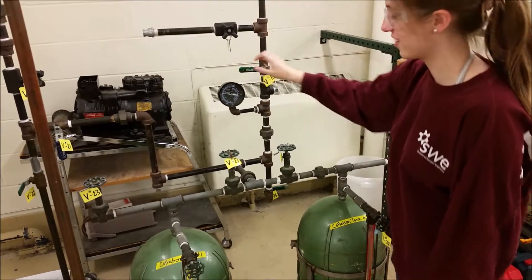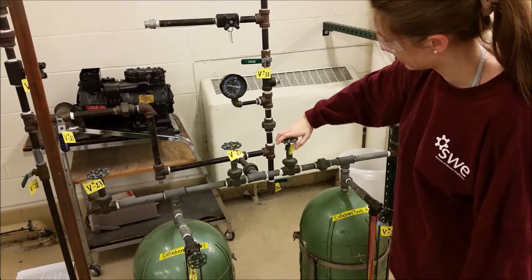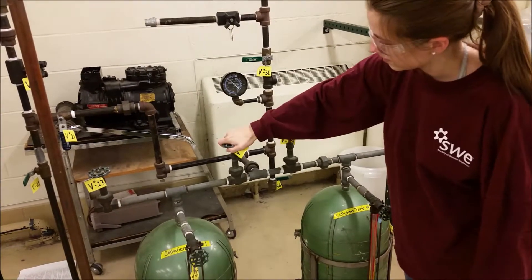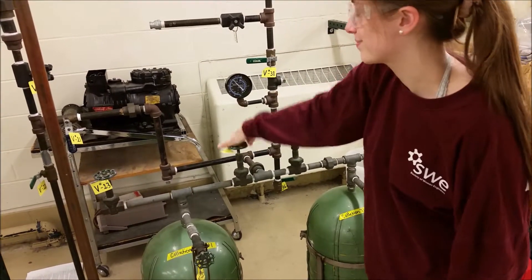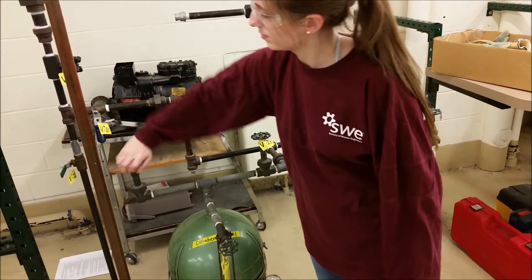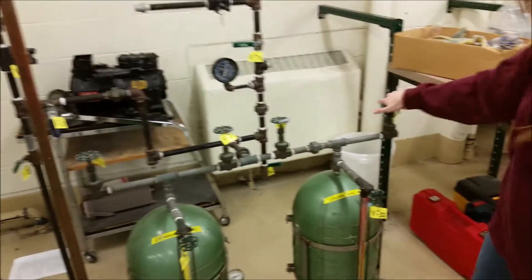Turn off the vacuum by closing V31, and opening V27, V29, V23, and V34. You will hear a small hiss as air enters the tanks. Drain tanks according to previously demonstrated procedures.